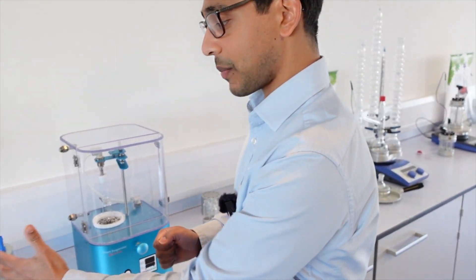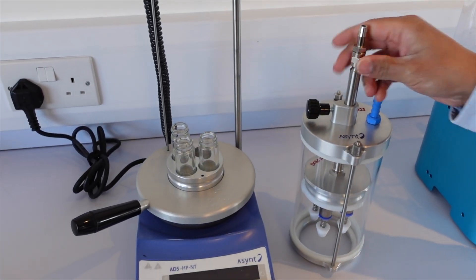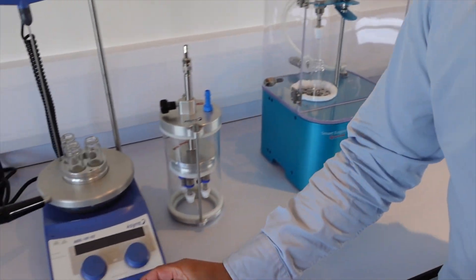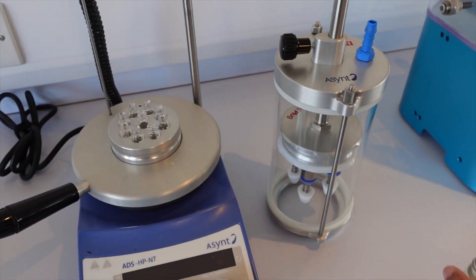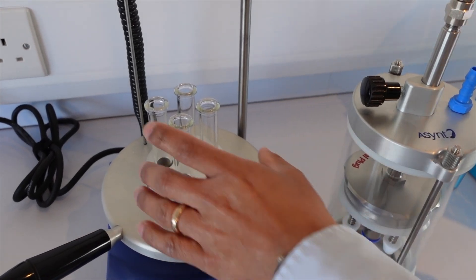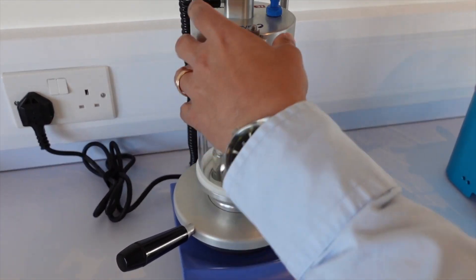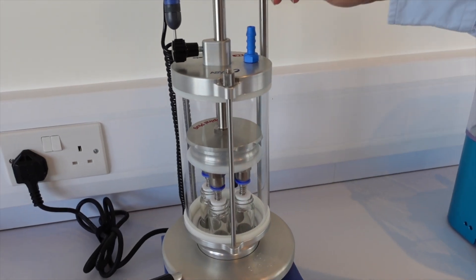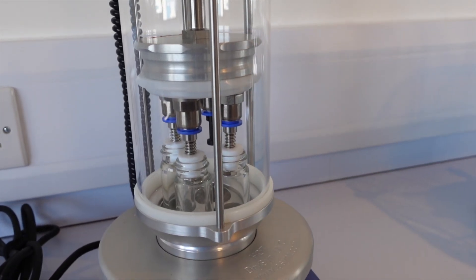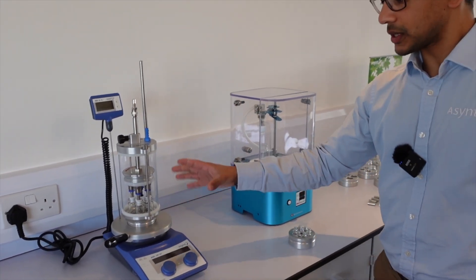If you want parallel evaporation, the Dyson spiral evaporator could be for you. You can run up to four vials at once of any of your favourite vial sizes — maybe small autosampler vials, or even very popular microwave vials. You can simply pop on the Dyson spiral evaporator, connect it up to a source of vacuum or even nitrogen, and you can get parallel evaporation in up to four vials or tubes at once and across a number of different sizes.